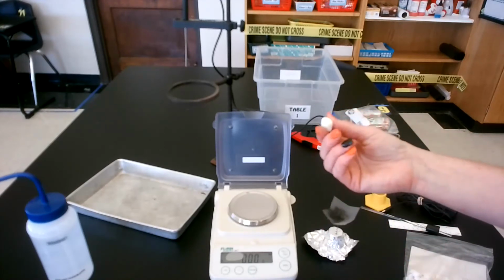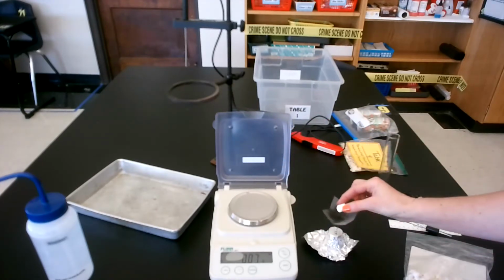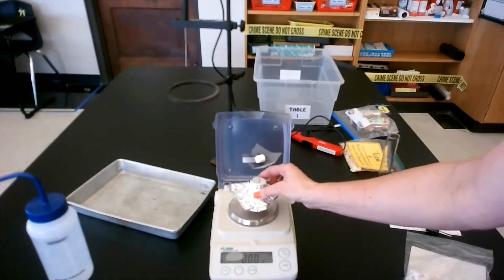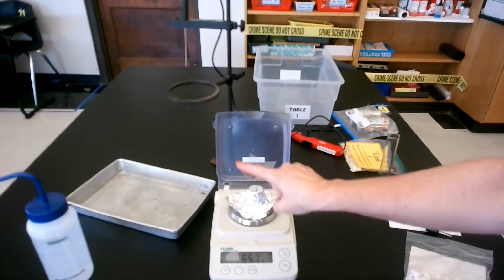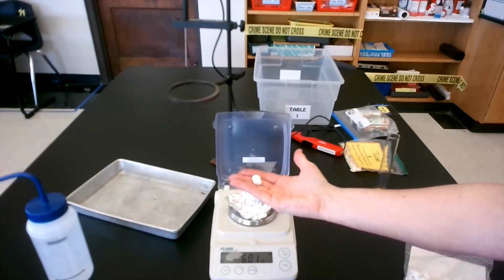I've been working on this one bag for about 6 or 7 years. So, it's crusty. So I want to find the mass of just the food. To do that, I've already found the mass of the food holder. Now I need to find the mass of all of this together. Make sure I'm zeroed out again. So I'm going to wait until it's done. In this case, it's 6.57. To find the mass of just the food, I'm going to subtract this mass from the mass I originally found with the food holder. Then I have the mass of just the food.